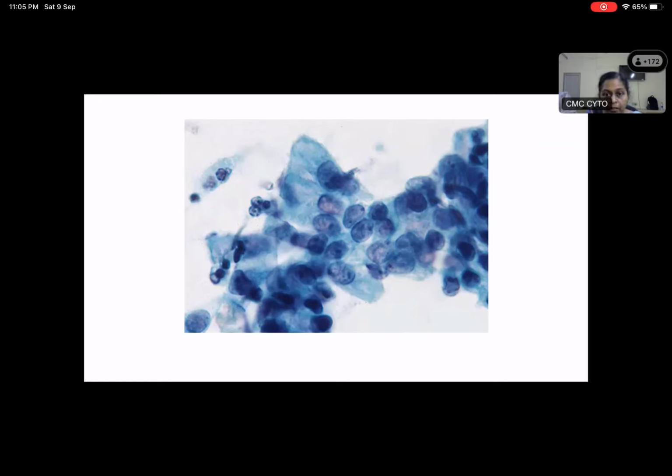So should you be worried? How can glandular cells come? You need to be worried, is it? But are you worried about the morphology of these cells? What is the chromatin looking like? Are you worried about the chromatin here? The nuclei are just hypochromatic, isn't it? Hypochromatic only. You can see one or two nucleoli. Yes, ma'am, chromatin is actually fine. You're not seeing coarse chromatin.